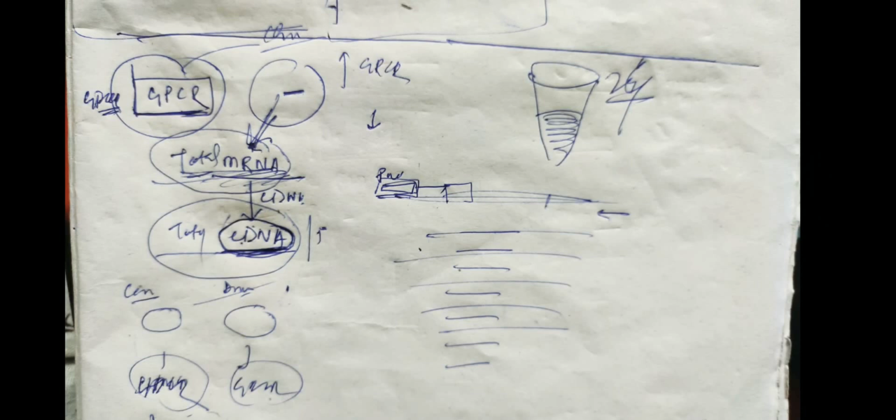In that case, you consider your cancer or tumor cell, with the application of that drug, and a control without that drug administered. So you have to pick two cell lines. One is a control, the other is drug administered, and then you pick up the total mRNA from there and make complementary DNA.